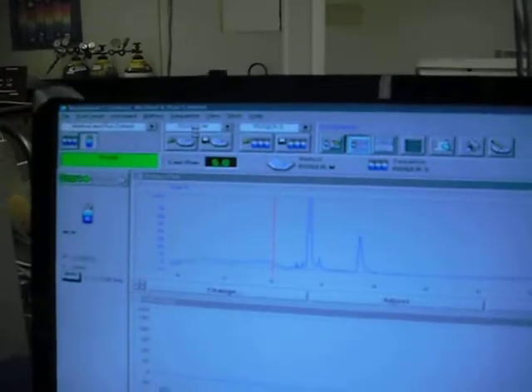Now those are the sequence parameters. Now in the sequence table, I get to specify where in the auto sampler everything is. The vial is the number of the location in the auto sampler. So that can be 0. The sample name is simply something that I specify, recognizable to me. The method name comes off of a pull down, and I know mine is roger.m, right? So it should also be in the list here.